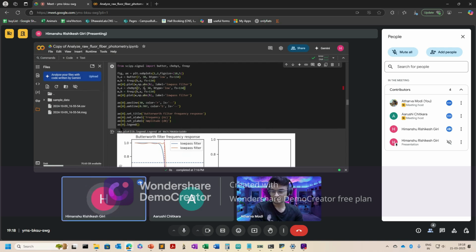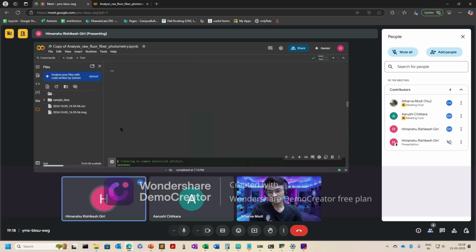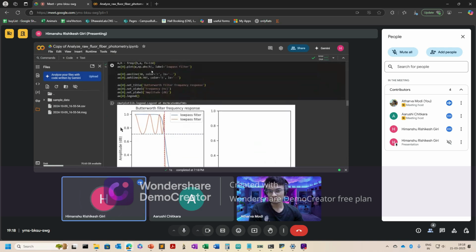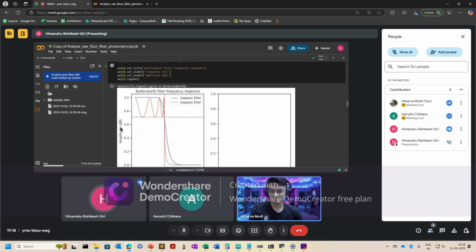So let's say it's very bad. Why is it Chebyshev, then? Why can't they keep this a straight line here? I think it has to do with the design of the filter.